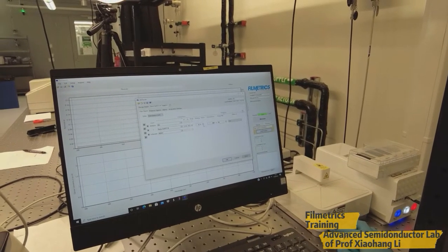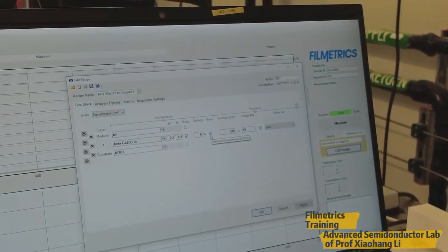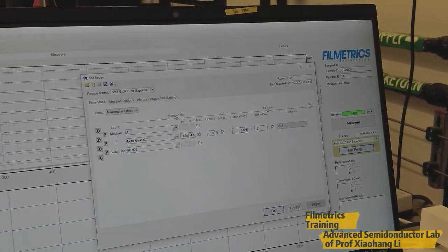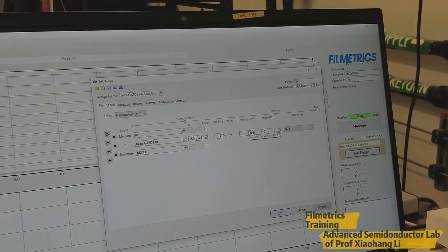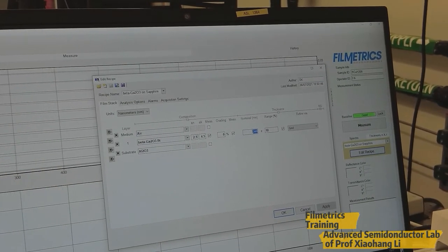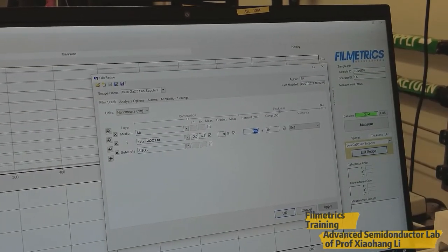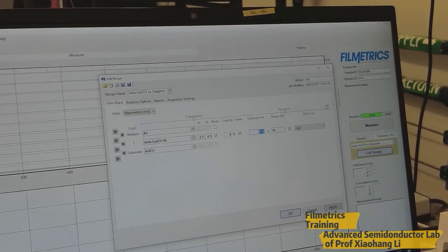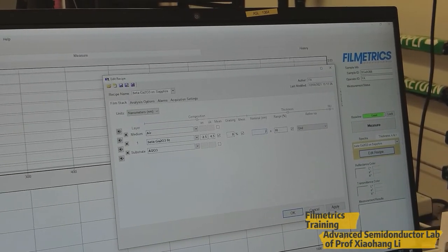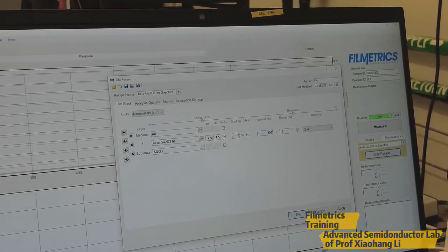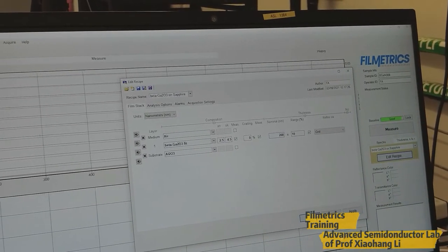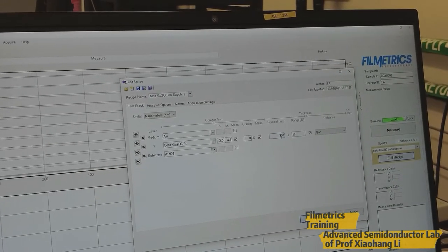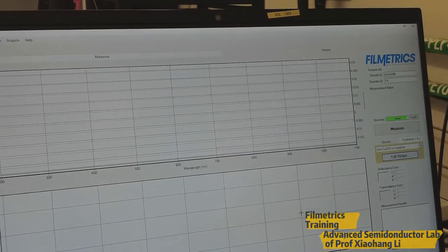So for analyzing this data, we need to know the range of thickness we have already grown. So according to which it will show you some reflectance, then we can fit it, then we will get the exact value. So I will just put 200 tentatively, then it will measure the reflectance and fit it accordingly. And I just put 200 as a thickness, then press OK.